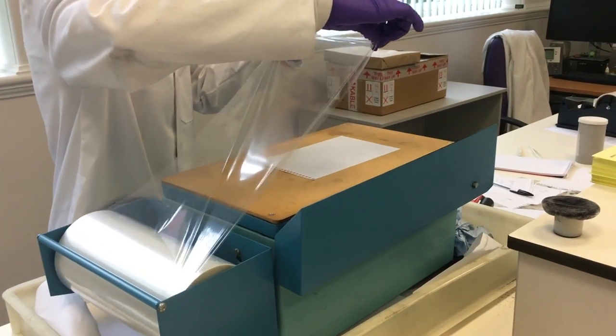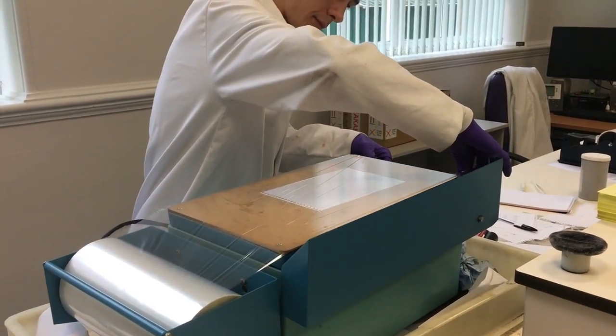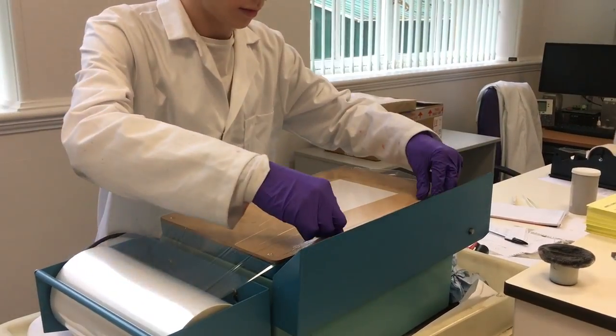The notepad is taken for evidence and placed onto the bronze plate of the ESDA. Mylar film is then pulled across the page and any creases and air bubbles are smoothed out by hand.